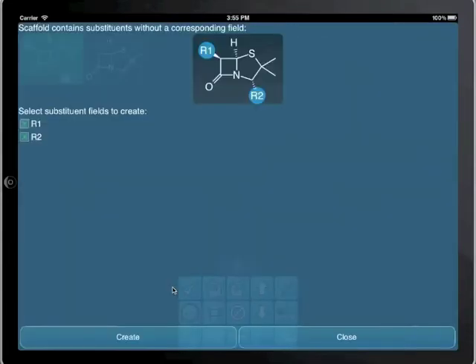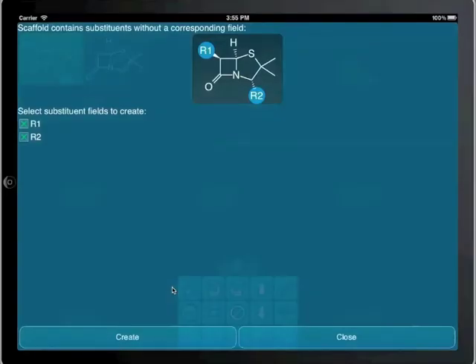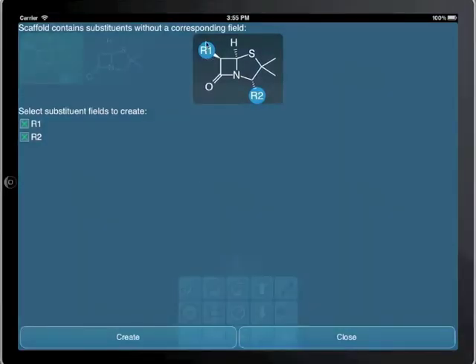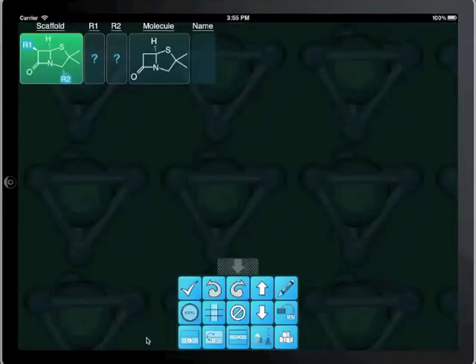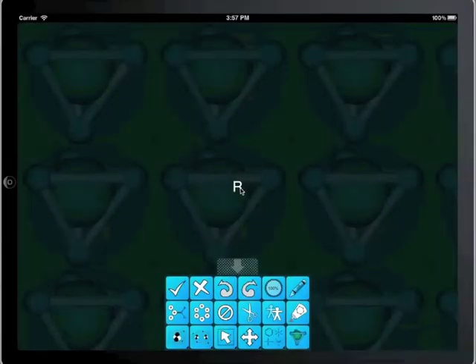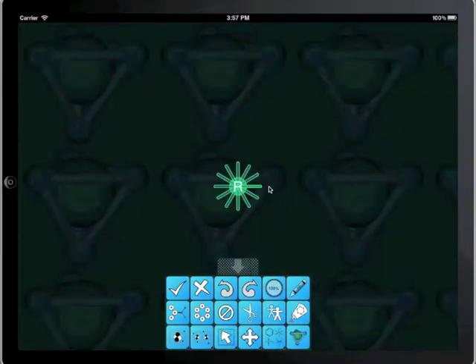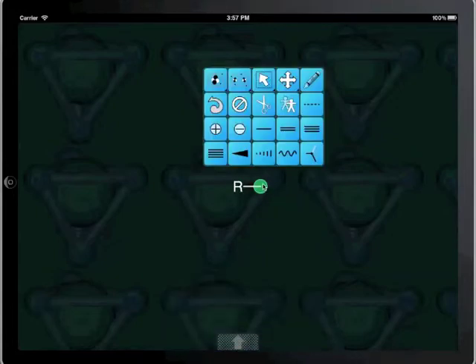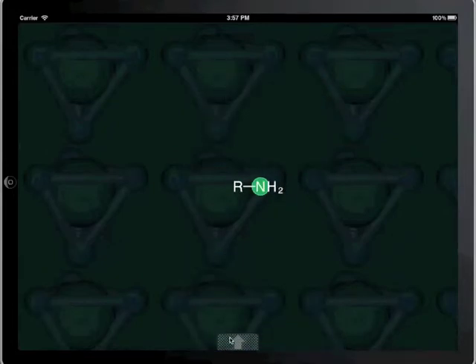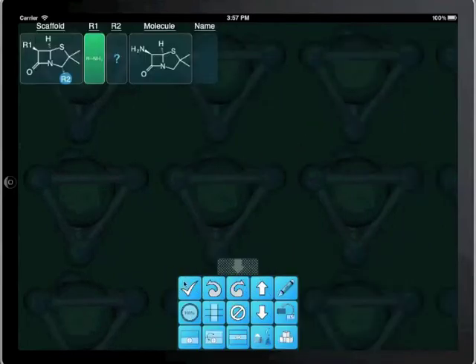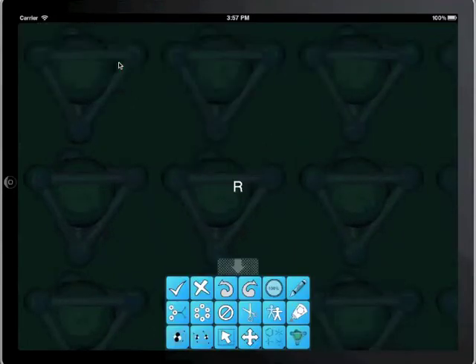When we accept the new structure, the app notices that there are two substituent placeholders, R1 and R2, and it offers to create new fields for them. We double tap the R1 field which opens the structure editor. It begins with a placeholder, R, from which we create an amino substituent. We do likewise for R2, in which case we draw a carboxylic acid functional group.